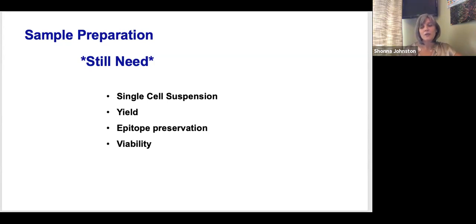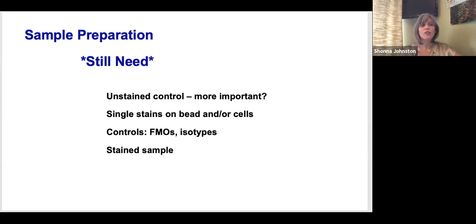The nice thing actually with the spectral flow cytometer, I don't know if I've got an example here, but certainly in some of the researcher examples that I've got, we can actually measure APC, AF700, APC-Cy7, and we can add in a near infrared viability marker as well, which is nice because it just expands the capability of the red laser quite a lot compared to what you would have on a conventional flow cytometer. So again, really important to make sure that you get all of those things right.